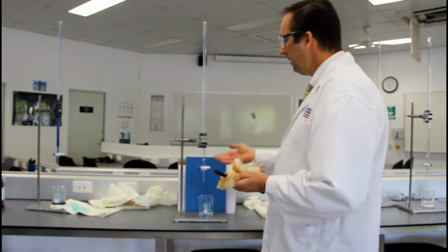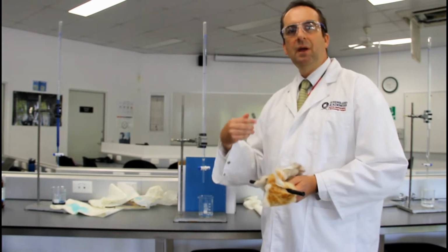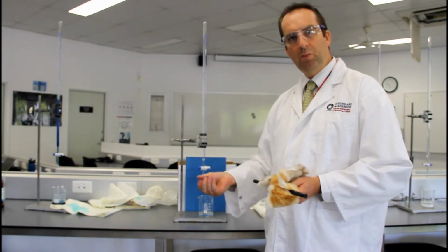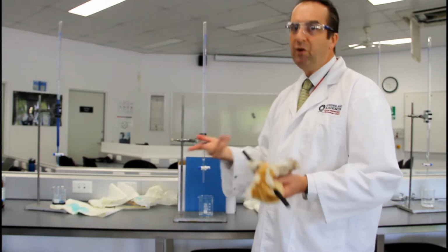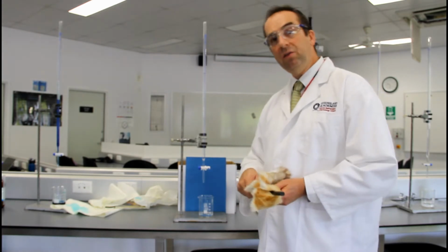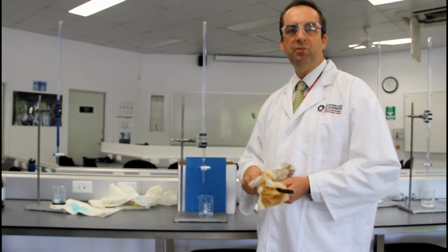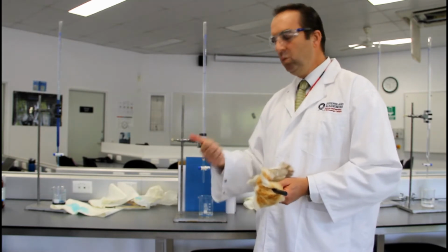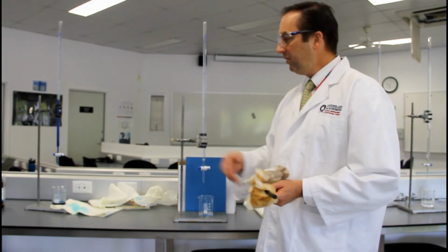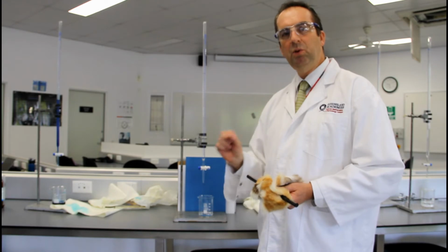Okay? So the 4 liquids I've got here are hexane, ethanol, acetone or propanone, and just water. Very pure water, from distilled water. And the ethanol is also known as absolute ethanol. Most ethanol you buy in the shops is a solution with water and often with methanol as well. This ethanol is very, very pure. It's been highly purified, so it's pure ethanol.